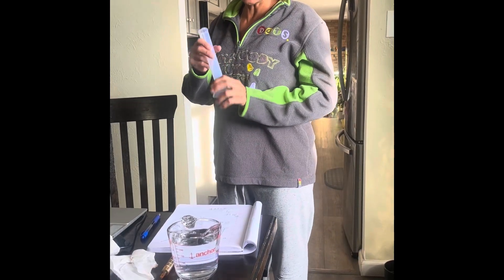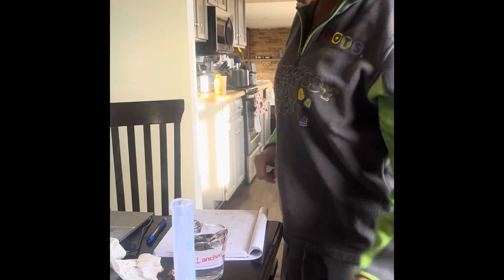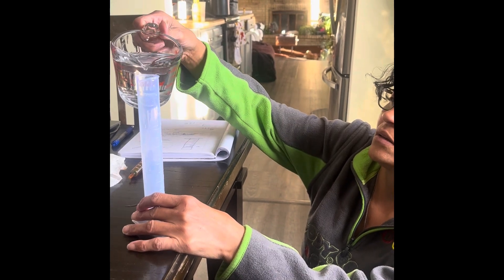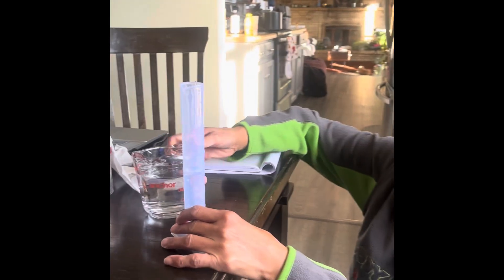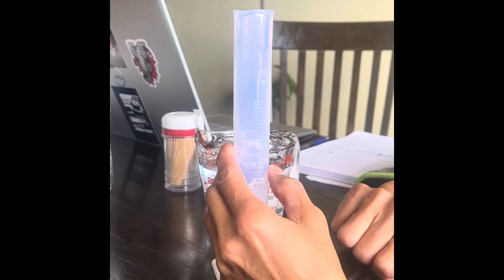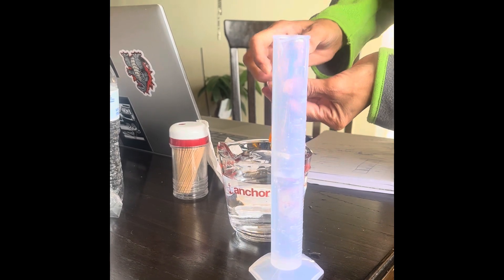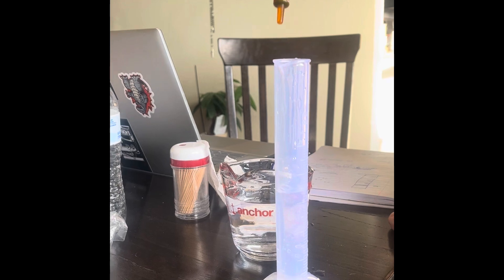In this 50 milliliters graduated cylinder — good for the 20% wall — I'm gonna measure 33 milliliters. 1, 2, 3. I need to do 2. It's 2. 33.